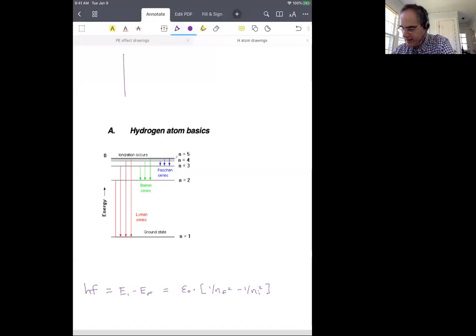Okay, so I assume that your results look something like this. They consist of a series of emission lines in a spectrum, okay? And you should probably see a set of sharp emission lines. You may see some other broad features at lower intensities.